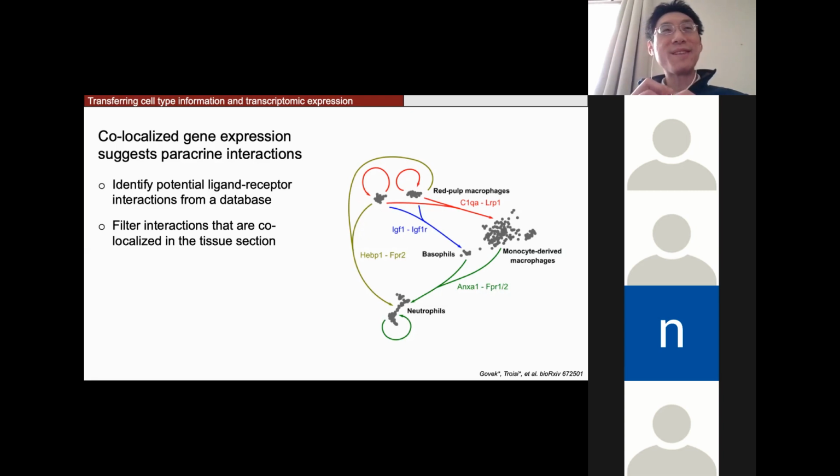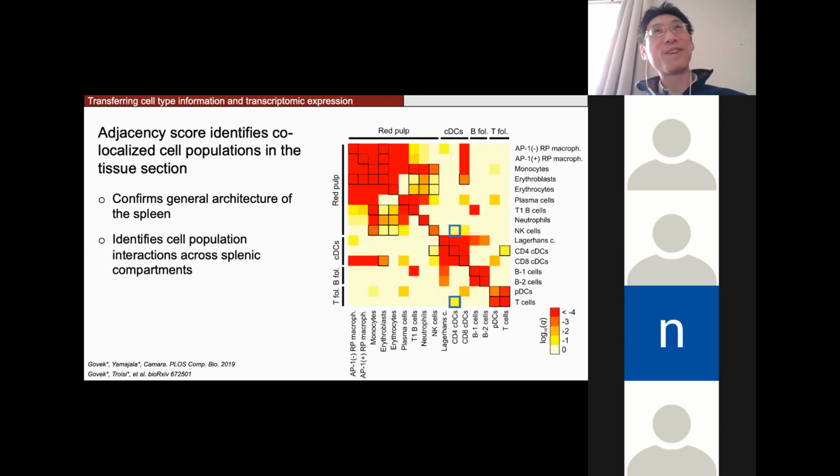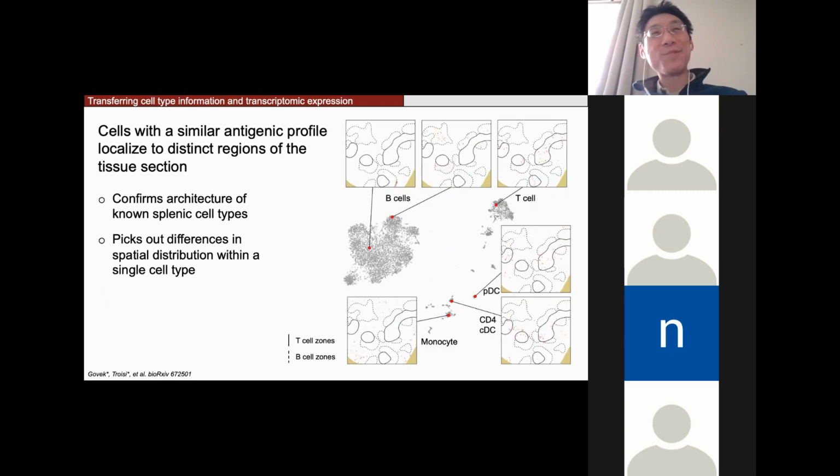So I'm curious, if you pool your codex single cell data with your CiteSeq data, but in codex you only have proteins, and in your CiteSeq data, if you only take proteins, and pool the two data sets together as one data set and analyze, what are we going to see? I'm super curious. That could be very interesting.